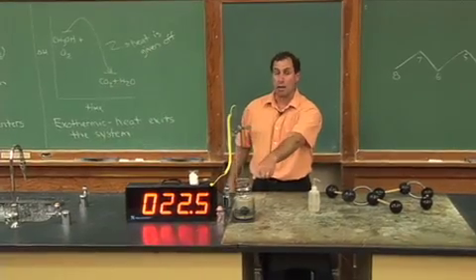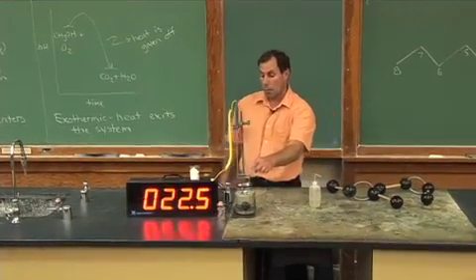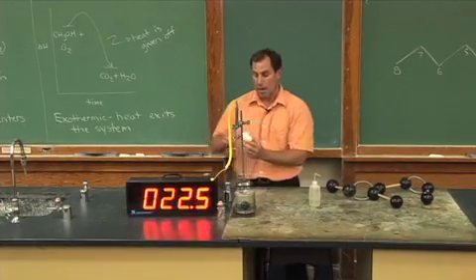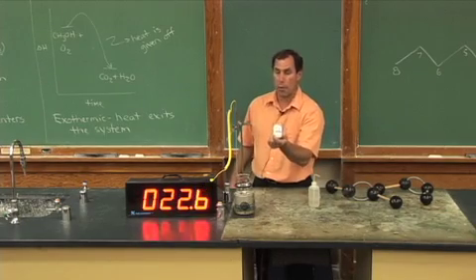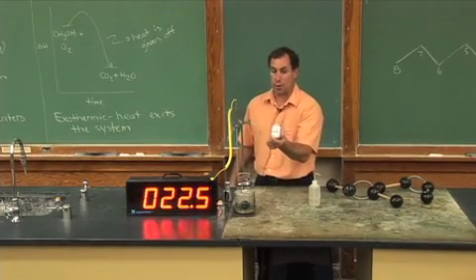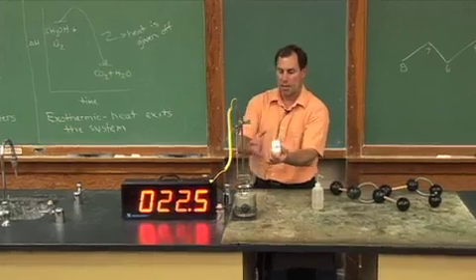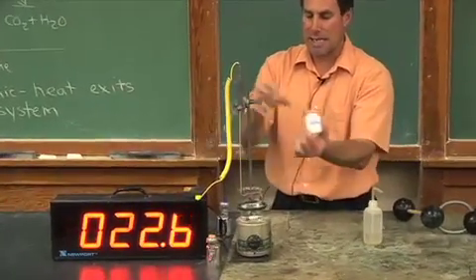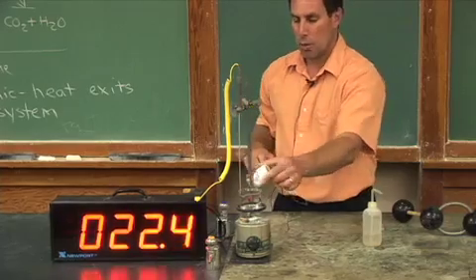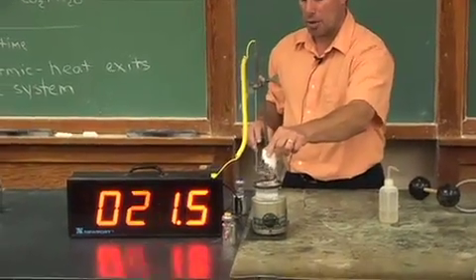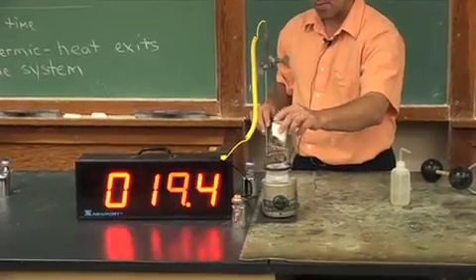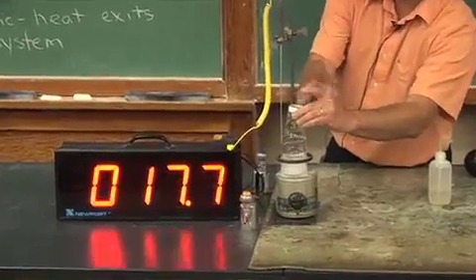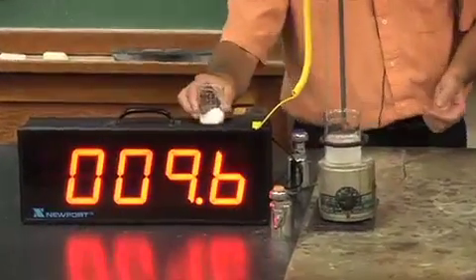I'm going to dissolve a solid, which is actually going to promote an endothermic process. The solid is called ammonium nitrate, and I have the formula on the board, and I'll point that out to you in just a moment. What's going to happen is water molecules will surround this, and the reaction actually sucks in energy. So we're going to see a nice little temperature decrease here. So as I tap this in and it's stirring, we're going to see the temperature decrease.